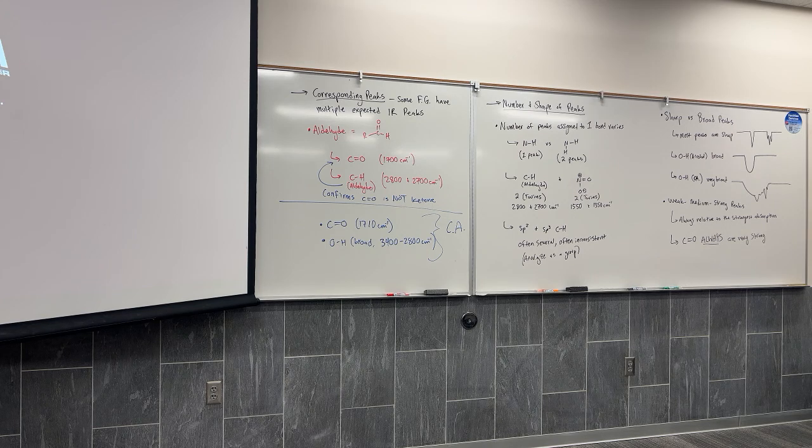All right, so I want to look up one more molecule for you guys, and in the last 7 minutes, what I would like for you to do is try to identify all of the bond types using a correlation table, all of the bond types that are present in the compound.